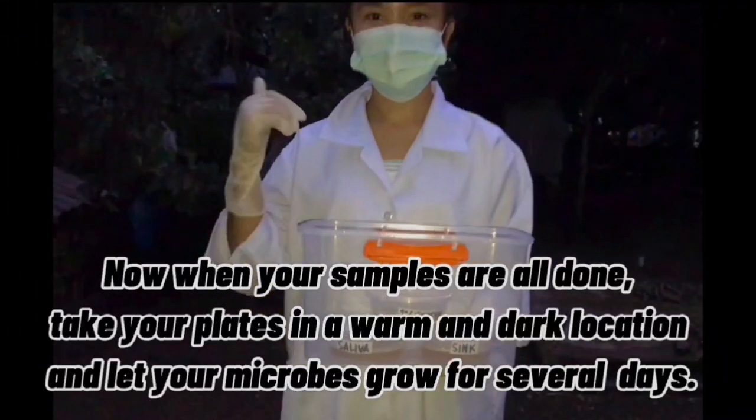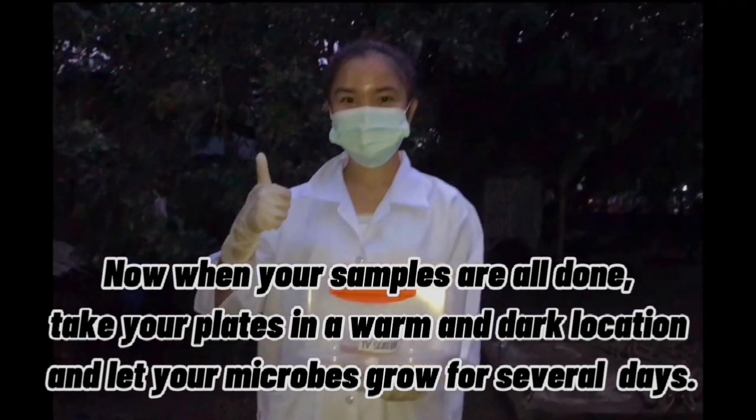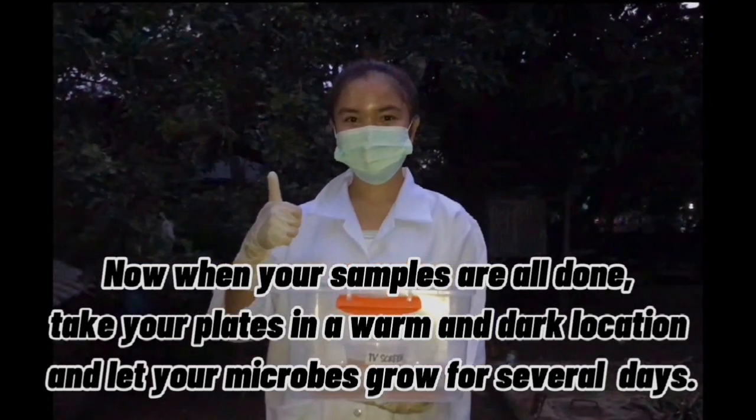Now, when your samples are all done, take your plates to a warm and dark location and let your microbes grow for several days.